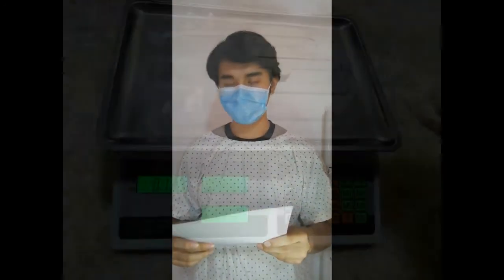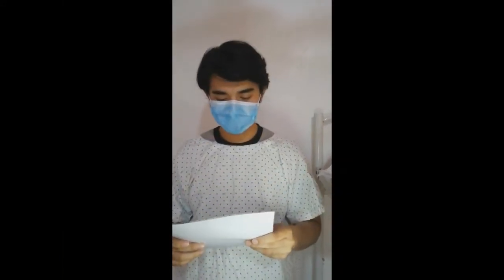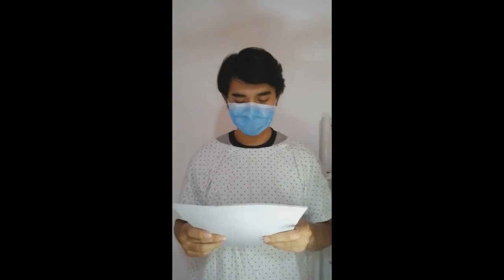For this semifinal experiment, we want to see if a chemical reaction alters the mass of our sample. We first measured the mass of the container with water and an Alka-Seltzer. We then mixed both in the same container and found out that in this reaction, we form a new substance, carbon dioxide gas, which is a chemical change.